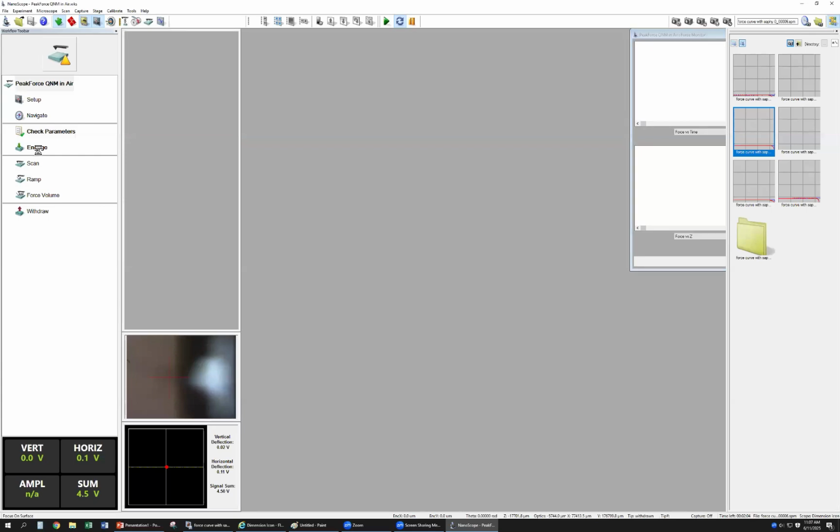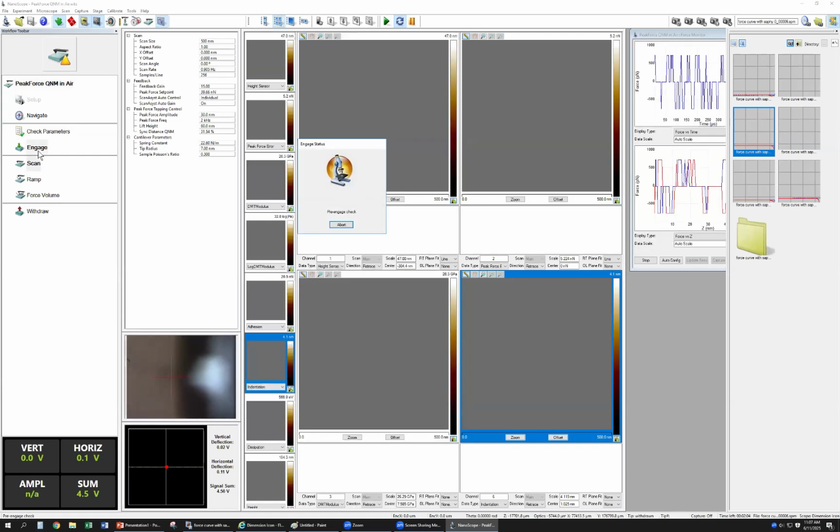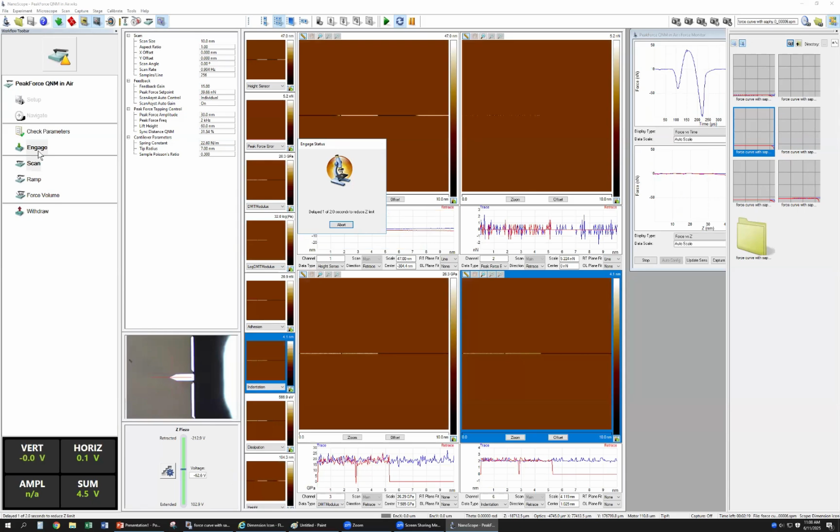Okay, so you just engage on the surface. Okay, so we engage on the surface.